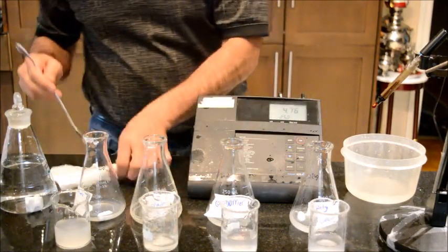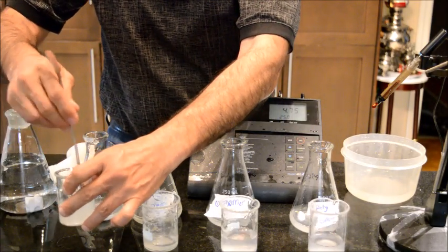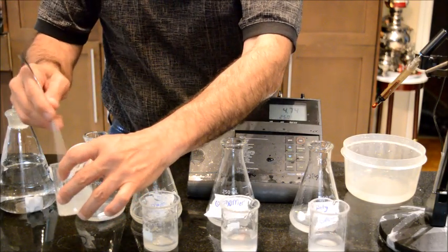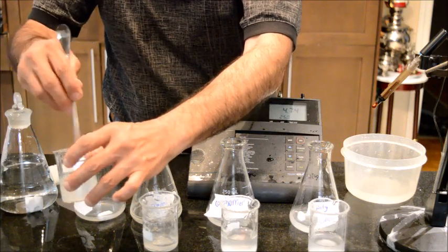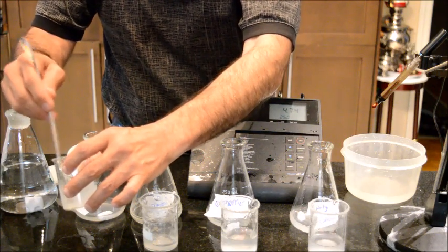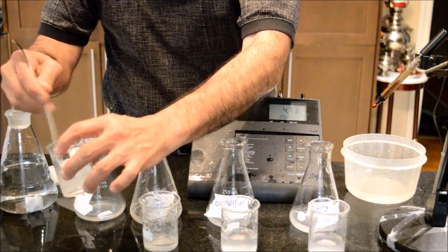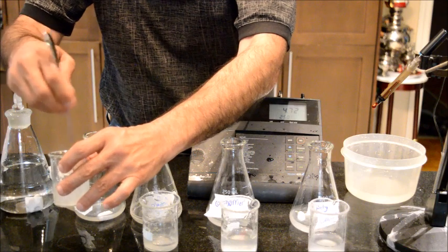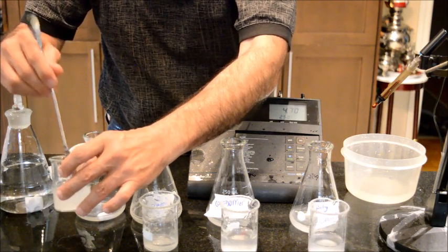And the last one is my Xanthan gum. Because I've done this before, I know what to expect. The Xanthan gum definitely reduces the viscosity a little bit because I'm adding liquid to it. But in comparison, it doesn't increase viscosity nor decrease viscosity. It's unaffected, I would say.